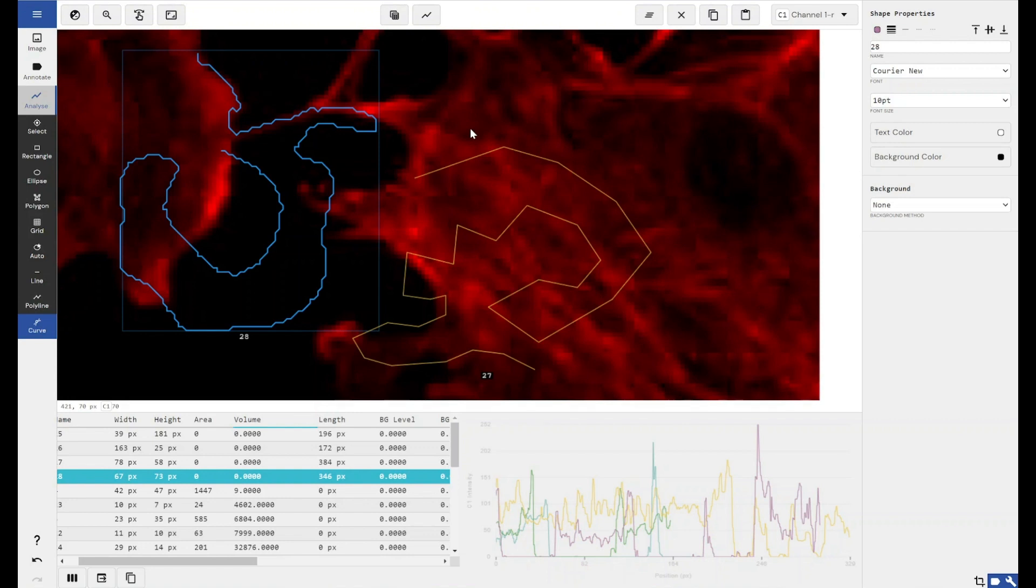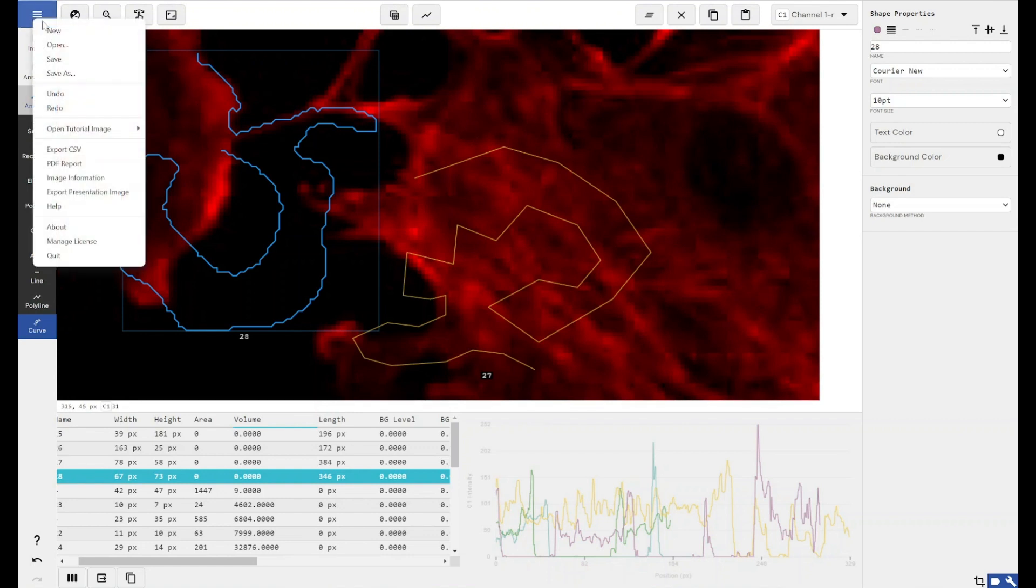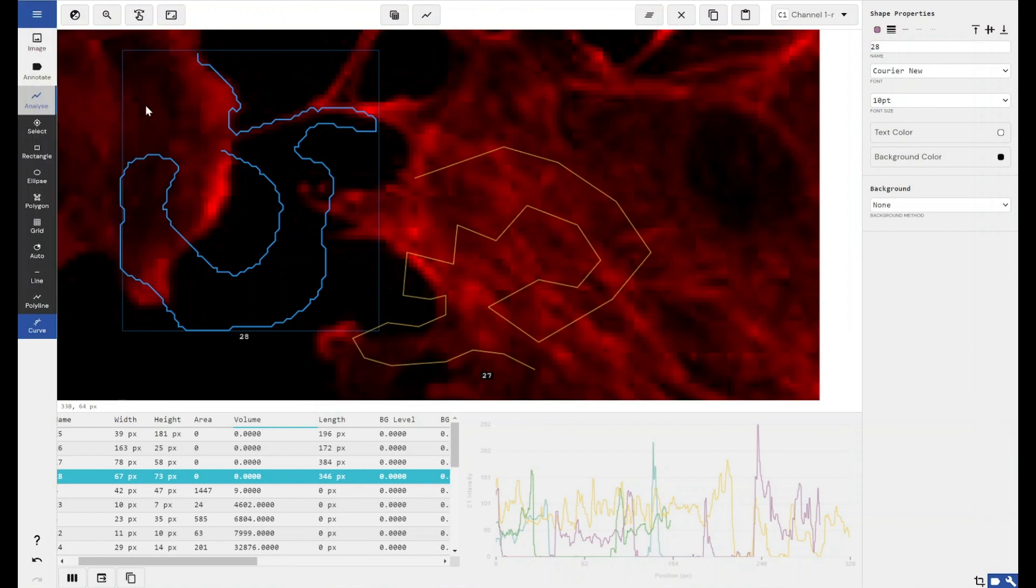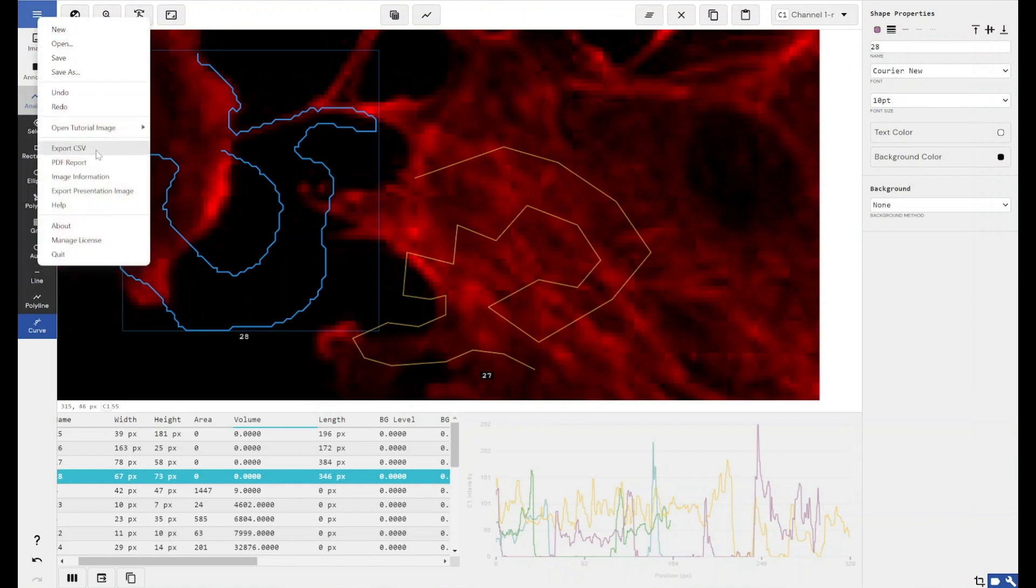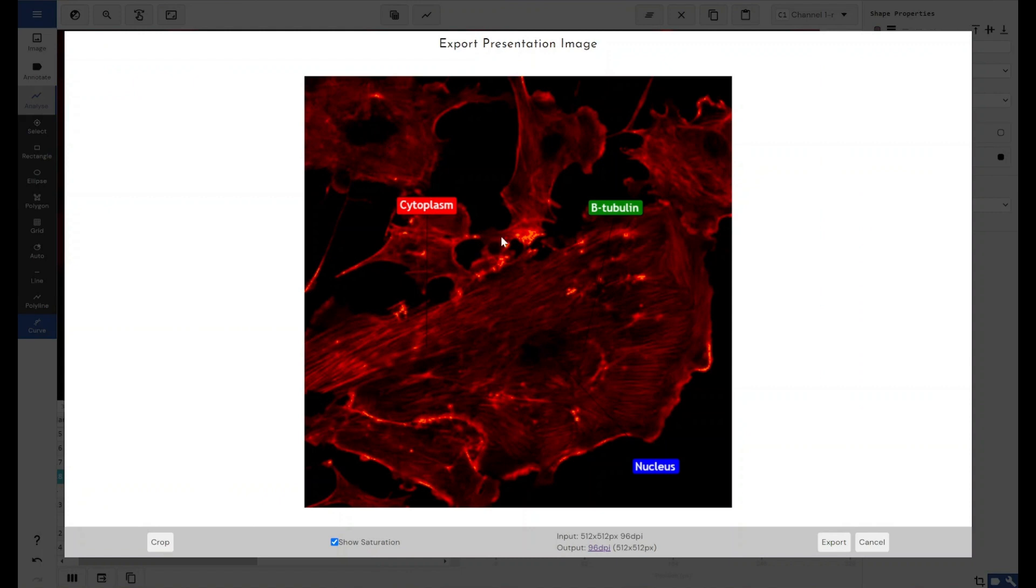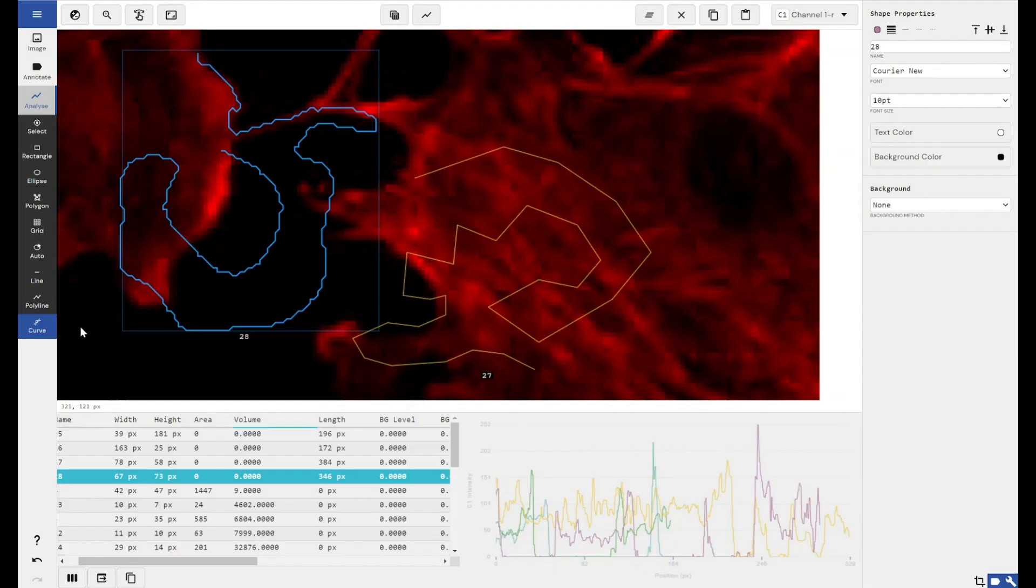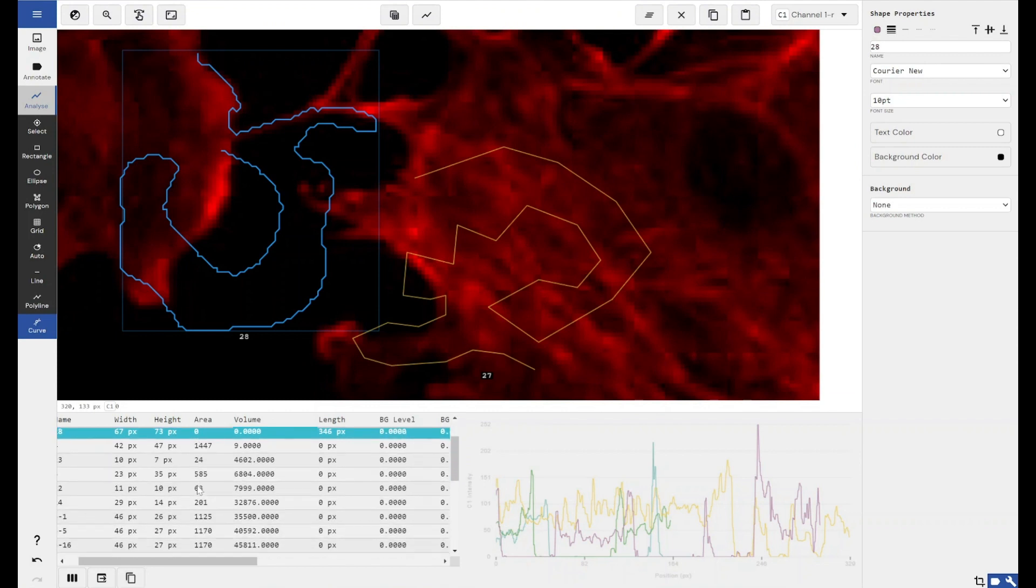Once you have finished your analysis, you can then export the results in a PDF or as a CSV for use in Excel by using these two options here. You can export your presentation image, which is great for presentations, papers, grant submissions, anywhere where you would typically use an image. And you can also copy all of the measurement values to your clipboard, and then paste that wherever you want it to go. Matlab, Excel, anywhere that supports the pasting of table data. Word would format it into a table.